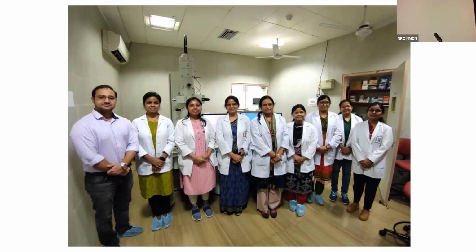Yes, you have a particular answer? Yes, pituitary adenomas. You have dense granules. You've heard about dense granules? Yes. So there are dense granules and sparse granules. So there is a role of electron microscopy. That is how you say they are dense or sparse. But as I said, it's a hypothetical answer, because no one will process a pituitary adenoma to look for sparse and dense granules, since now you have histochemical markers which can differentiate whether it is a dense or a sparse granule.